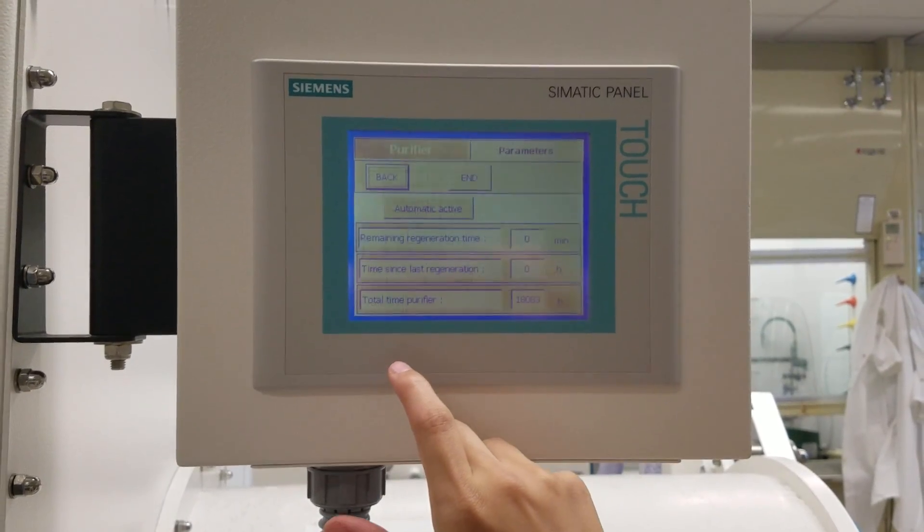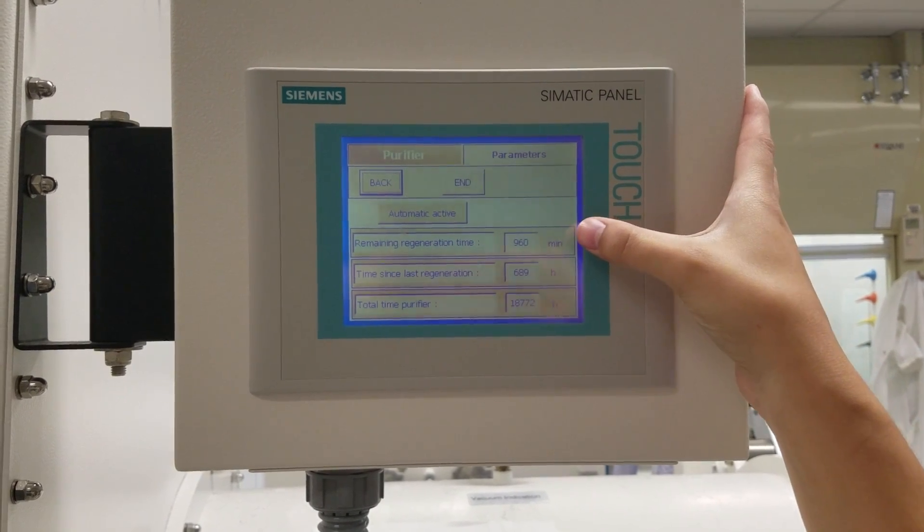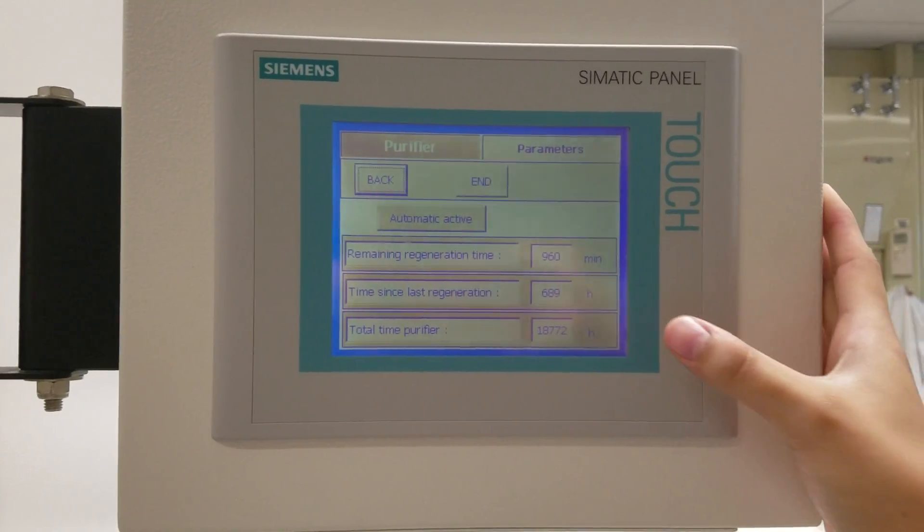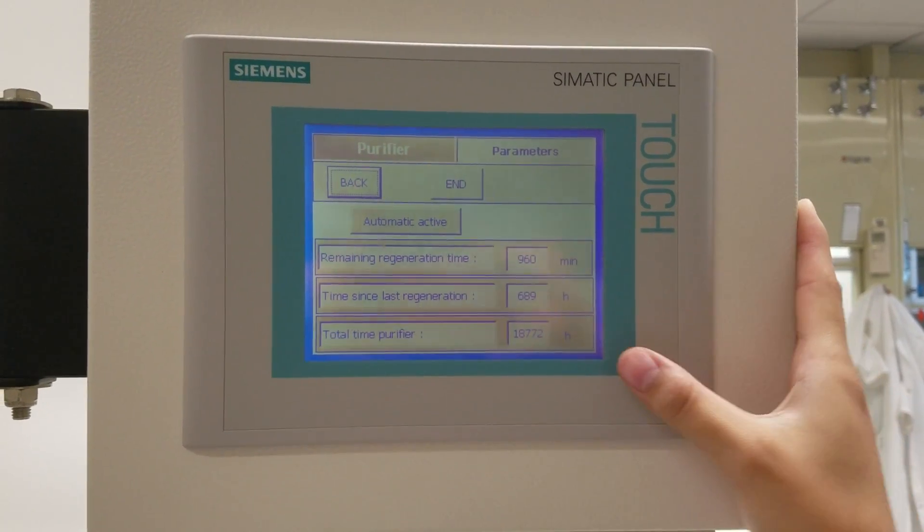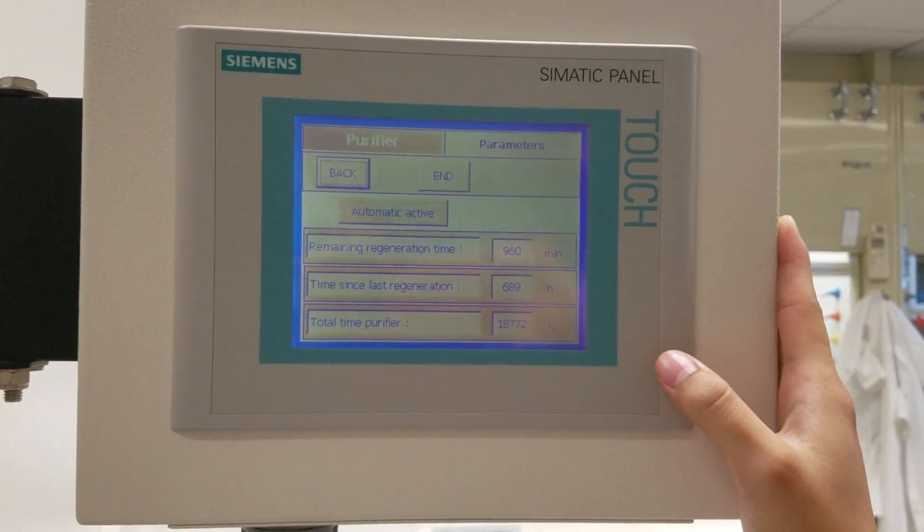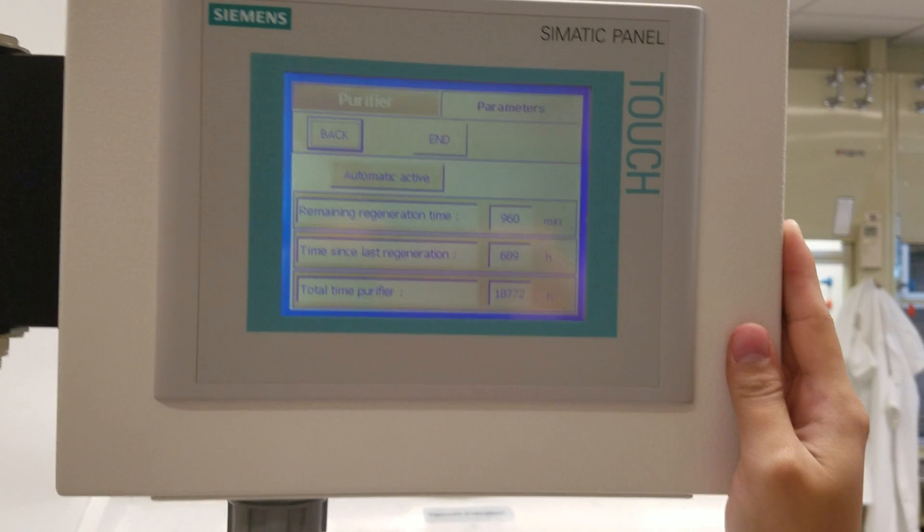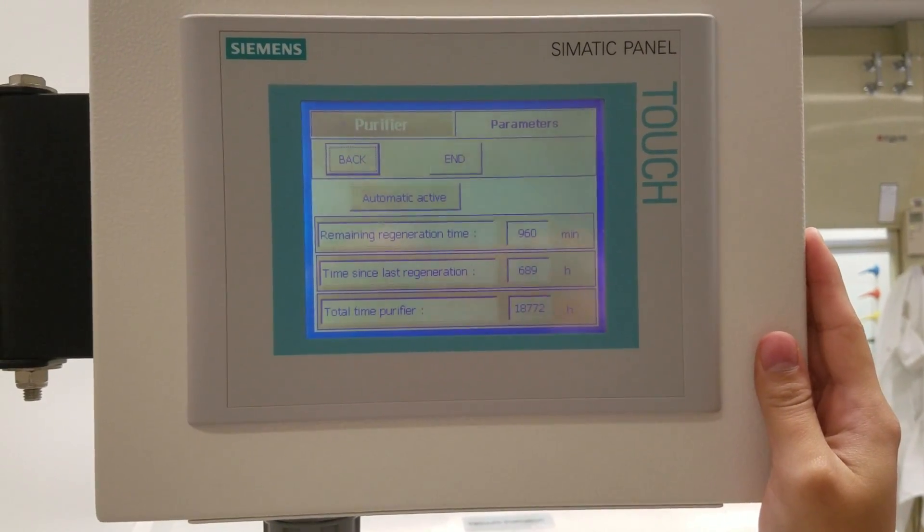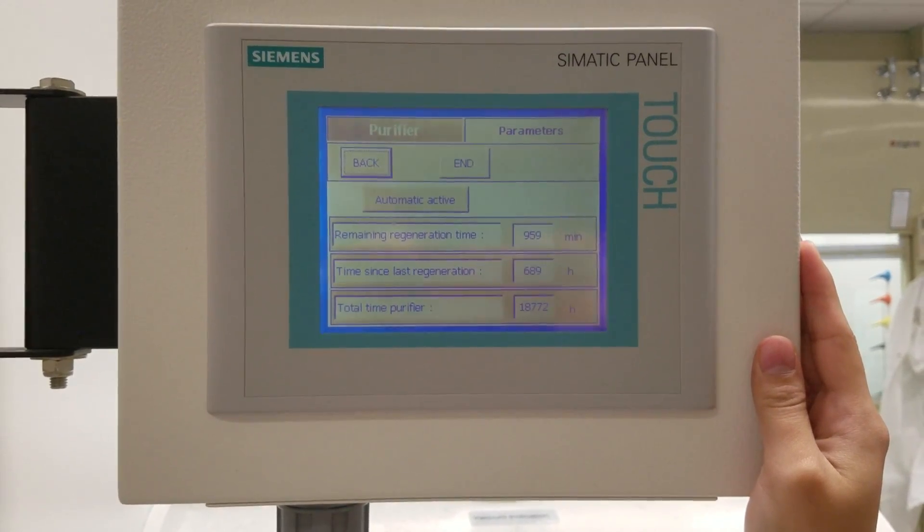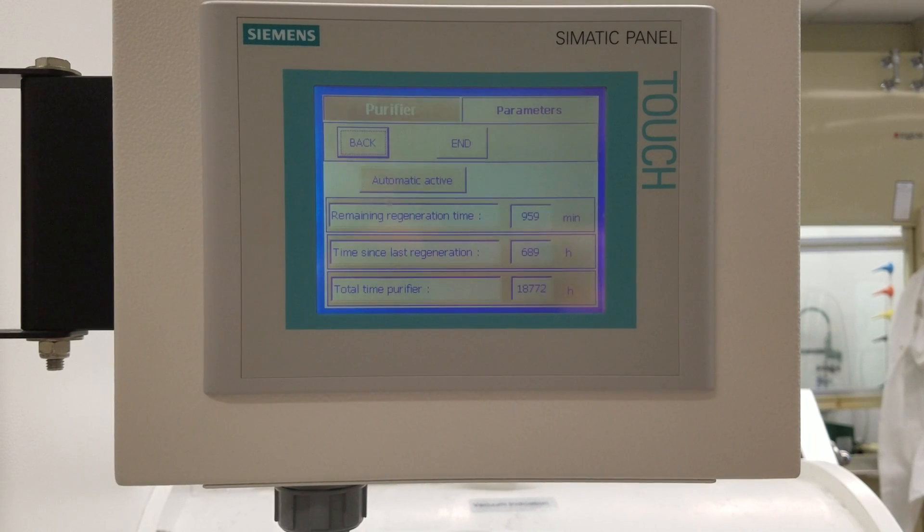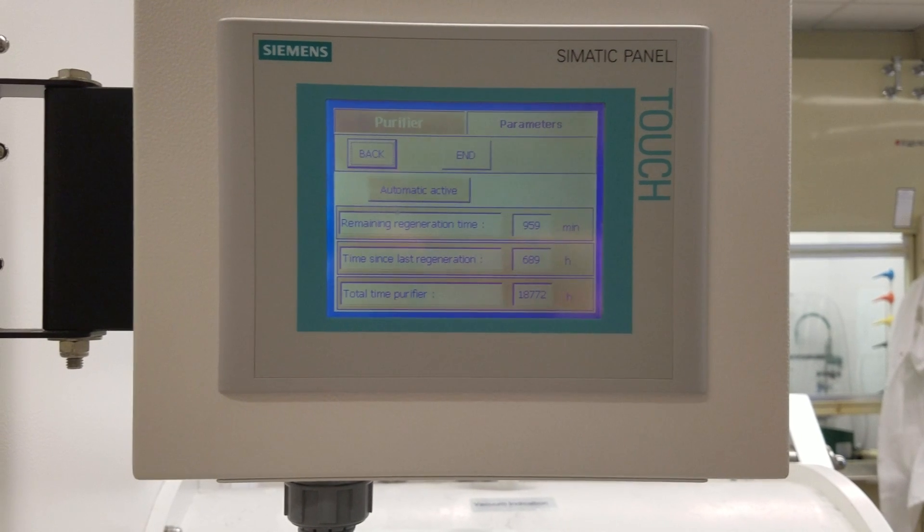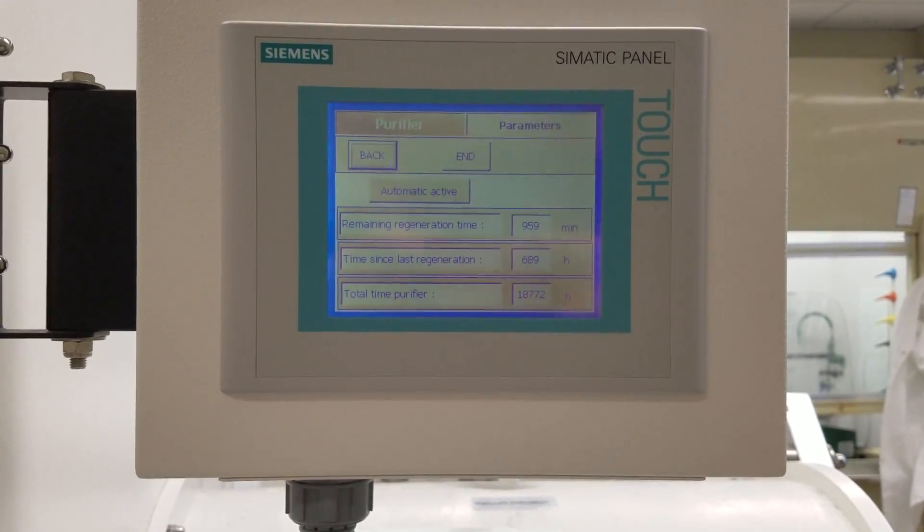If we go to status, we have the regeneration time, which is 960 minutes, which is 16 hours. The last time we did the regeneration, the total time that the purifier has been working. So, at this point, you just want to wait and make sure that the regeneration is going properly. As soon as we see 960 go to 959, we're done. There you go. So, regeneration is starting. Make sure not to touch the gloves in the glove box or disturb the atmosphere at all. The glove box will go back on circulation in 16 hours.